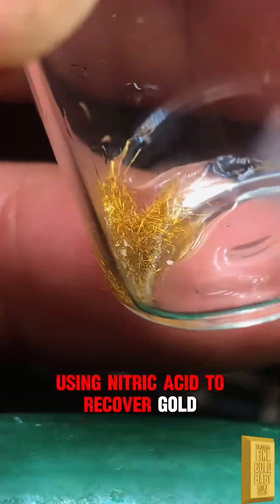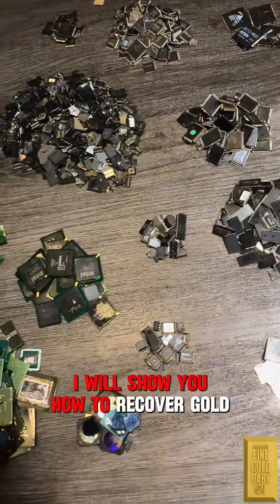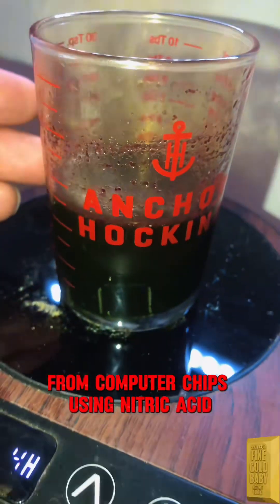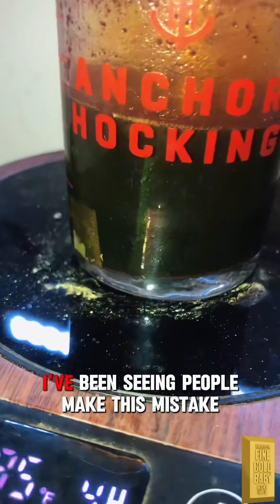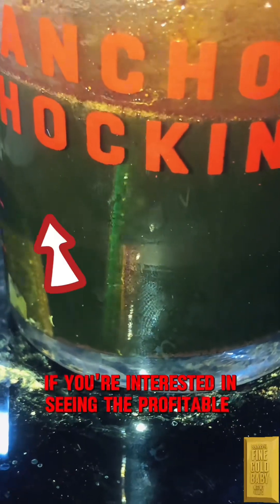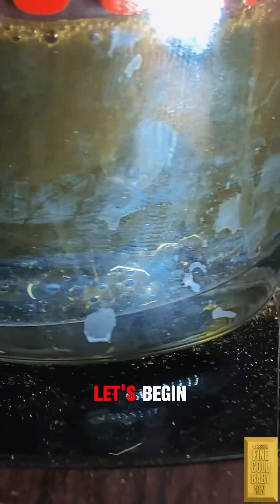Using nitric acid to recover gold from integrated circuit chips. In this video I will show you how to recover gold bonding wires from computer chips using nitric acid — though this is the wrong way. I've been seeing people make this mistake. If you're interested in seeing the profitable way, tap the comment above.